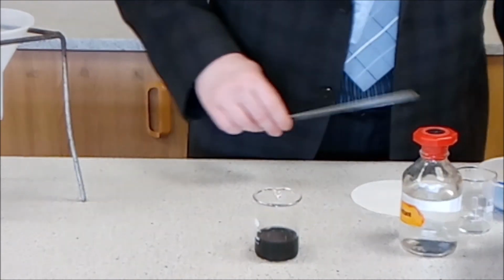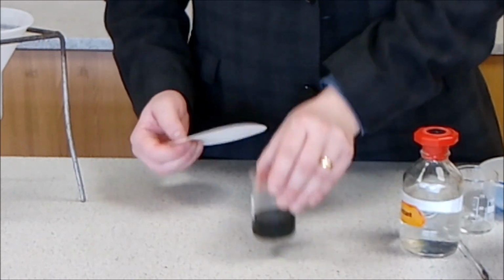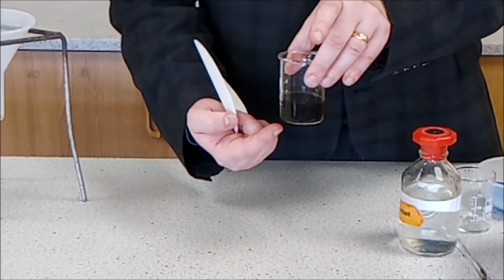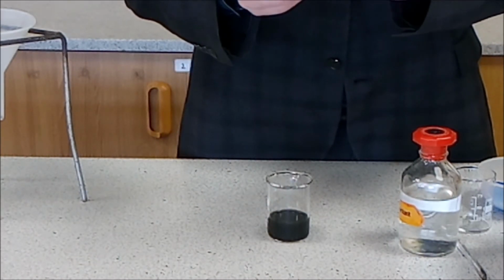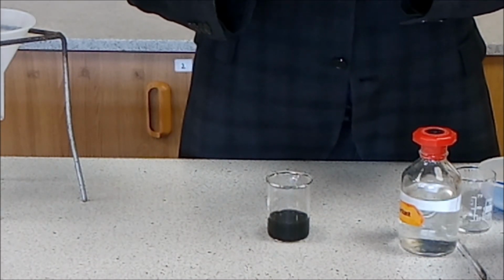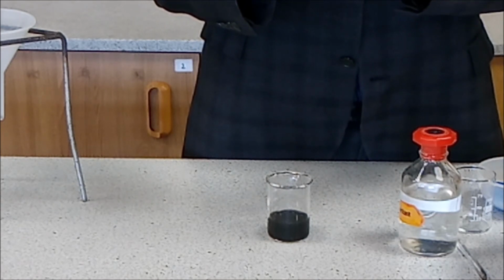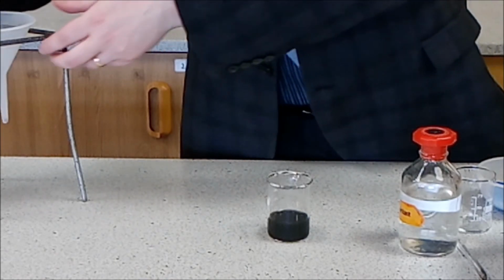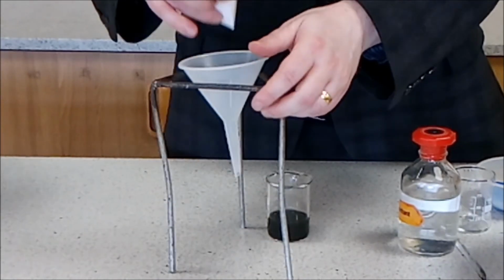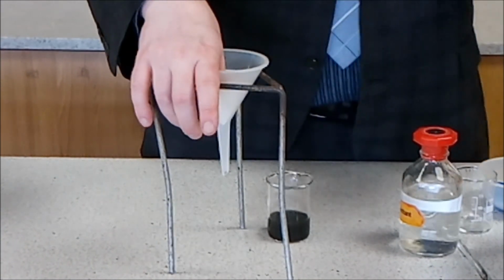So once you've stirred it for an appropriate amount of time, we then need to filter off the excess copper oxide. So we get filter paper, we fold that into quarters. You then place that inside of our filter funnel.